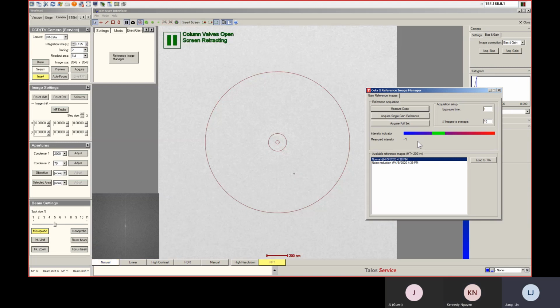First, we put the screen down. Sorry, you need to put the screen down. Now since your dose rate is 60%, you need more dose. Condense the beam a little more and measure again, maybe a little bit more.